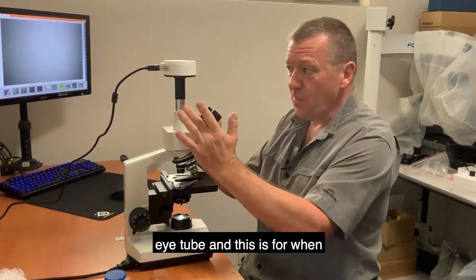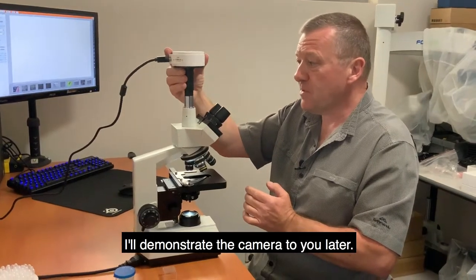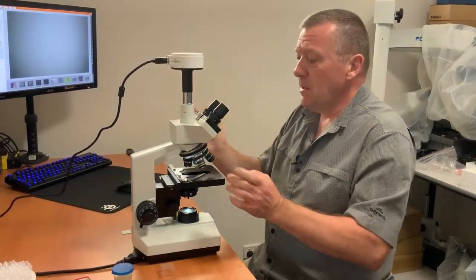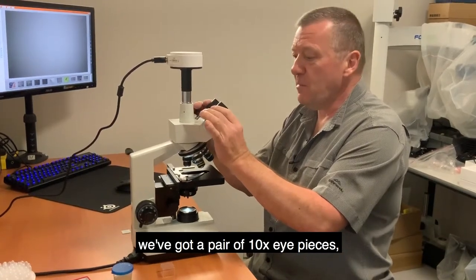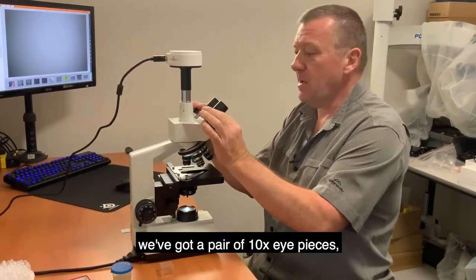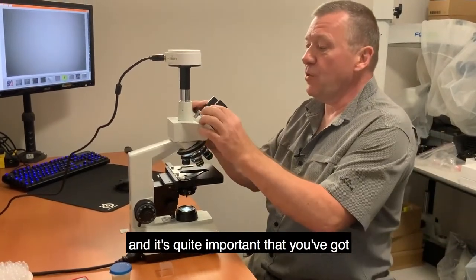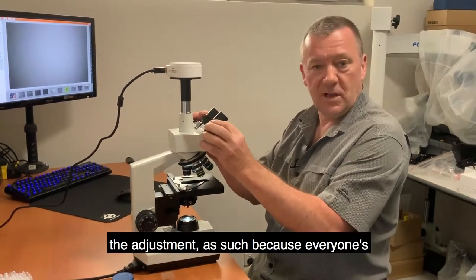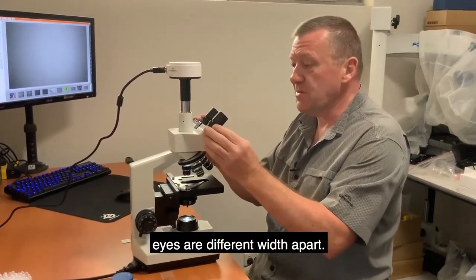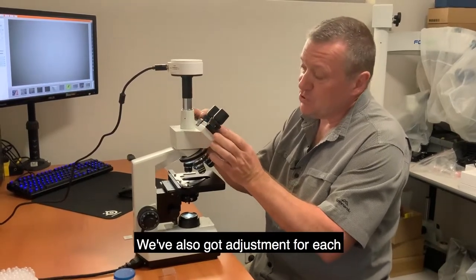The third vertical eye tube is for fitting a digital camera, which I'll demonstrate later. On the binocular head we have a pair of ten times wide field eyepieces. You can adjust the width between the eyepieces because everyone's eyes are different, and there is individual diopter adjustment for each eyepiece as well.